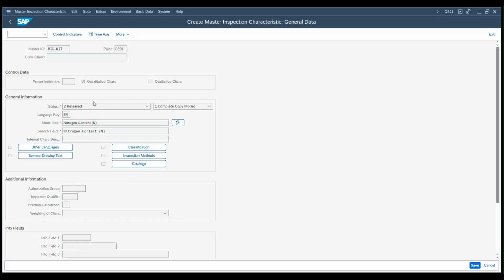Let's go to the second window. The default will be fixed scope. In other functionalities, we will see what we can do with this if we have many samples. We can put fixed scope or smaller scope or larger scope, etc. Not fixed means we can add as many samples as we want, many results as well.